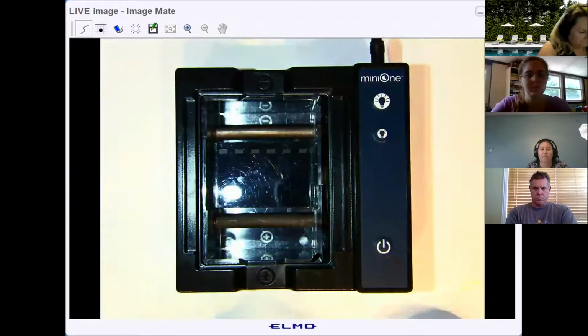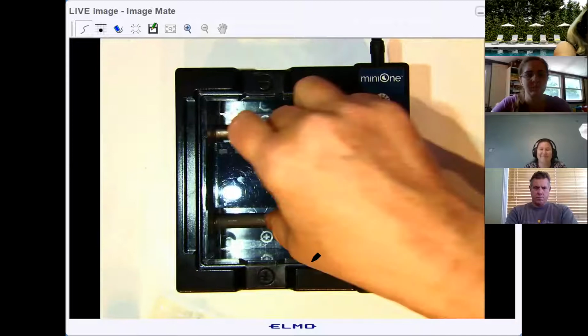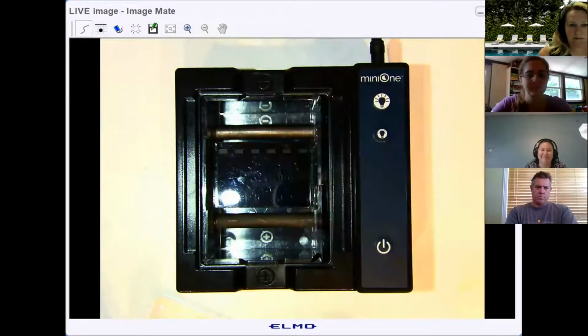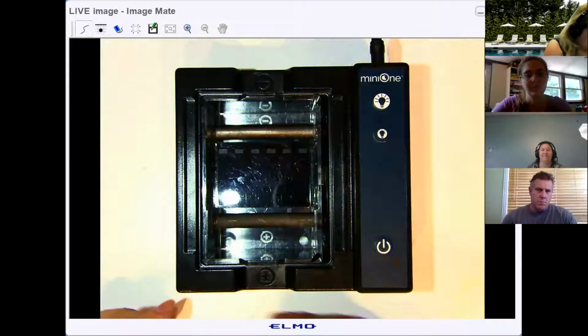All right. So here's our chamber. Whoops. Oh, geez. Okay, got it. You guys have never done that, right? Okay, the chamber has a little black plastic insert that has the markers for the wells, which is kind of handy because it provides a dark background as a target for when the kids load it.